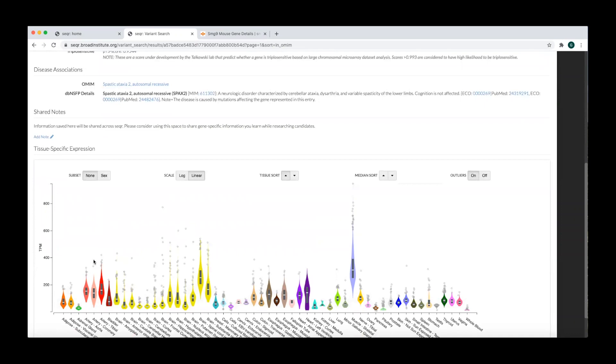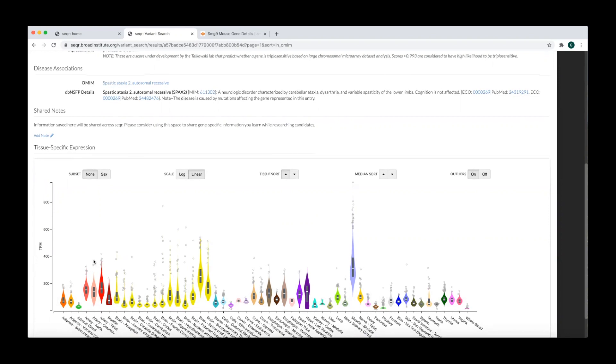In the tissue-specific expression section, you can see the gene expression profile imported from GTEx.